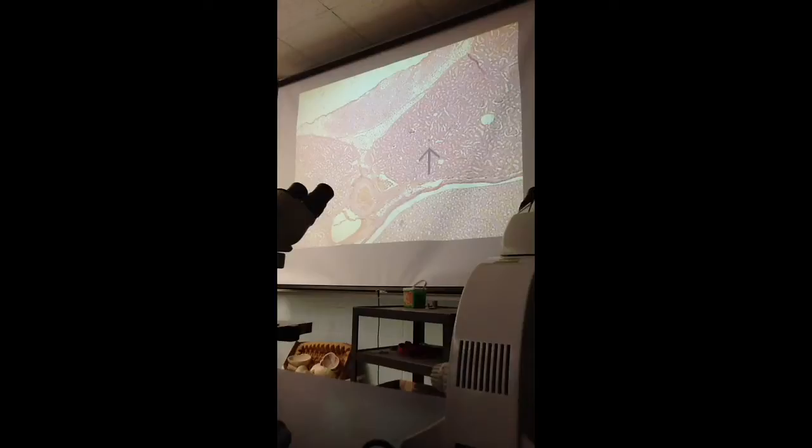Now you are looking at a section taken through the entire kidney. Probably this is the kidney of a monkey, so it's relatively small. But you can see the entire kidney. Here you are able to see the structure.